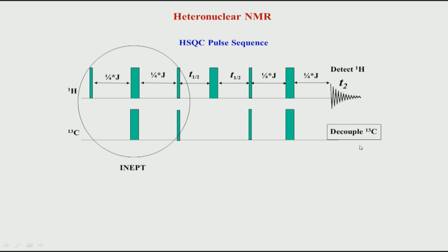Typically in 2D NMR pictures, if you read literature and papers, you will see that we show the top portion as hydrogen and the bottom portion as carbon. Why is it shown like this? It is shown because this is hardware. If you go to the hardware details, when you apply pulses, you apply them on a proton channel. Dedicated amplifiers, dedicated frequency generators and dedicated preamplifiers are dedicated for protons, one set of them, and another set is dedicated to carbon.